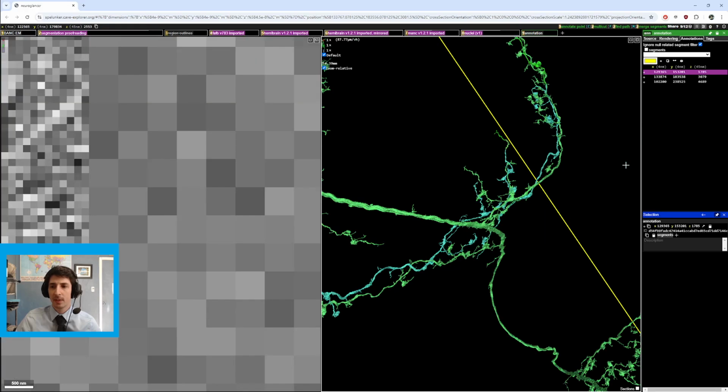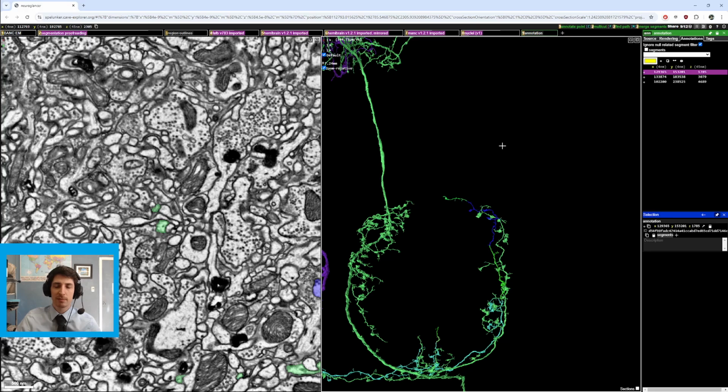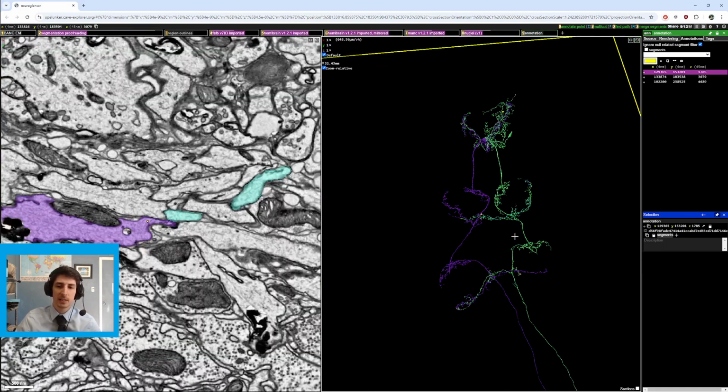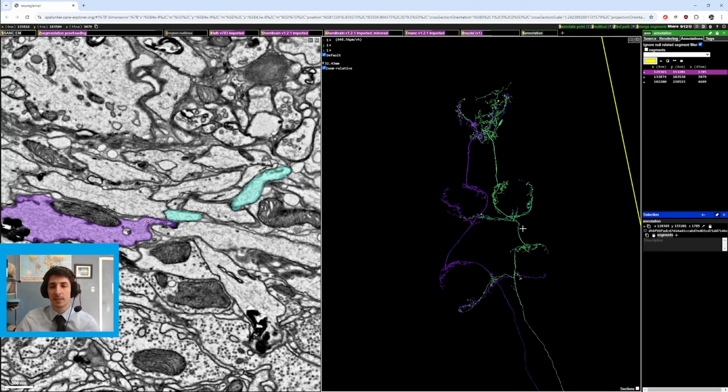So this sort of triangle is indicative of a branching point. And then we followed it to the end to make sure that this end didn't connect to a different cell. Because if it did, we would want to double check our assumption that this connected, but we seem to be correct about this branch. So that's that missing branch.